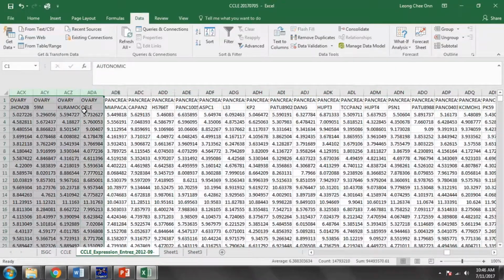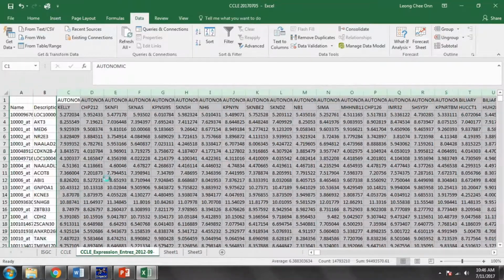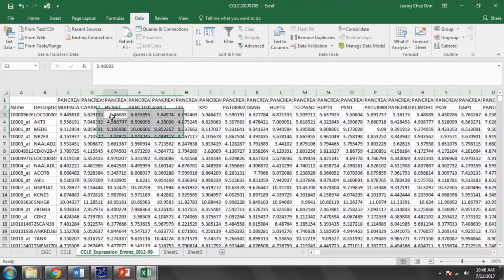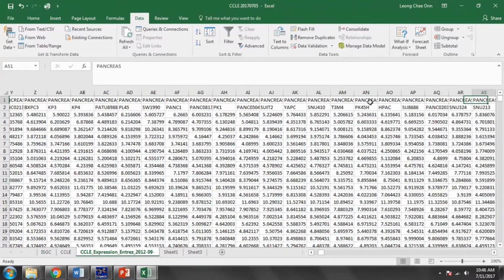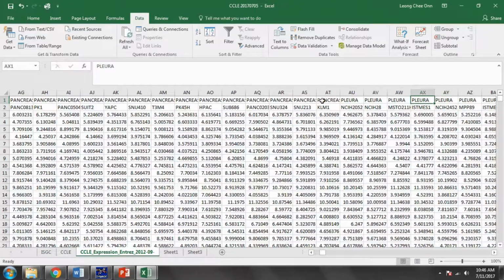Okay, so we can delete all this part here. Now you have your pancreatic, pancreas, here.